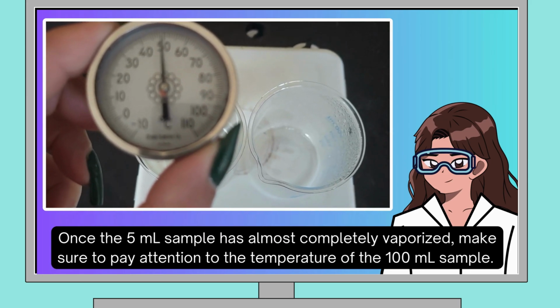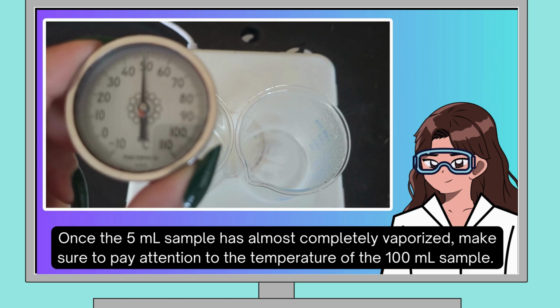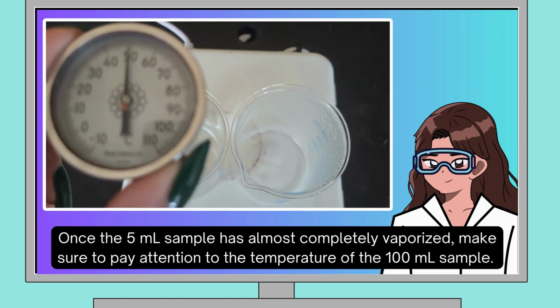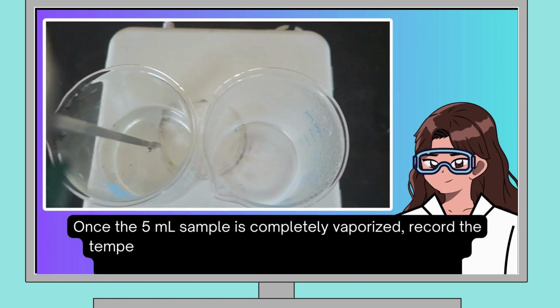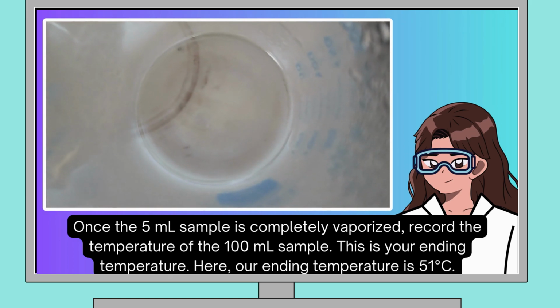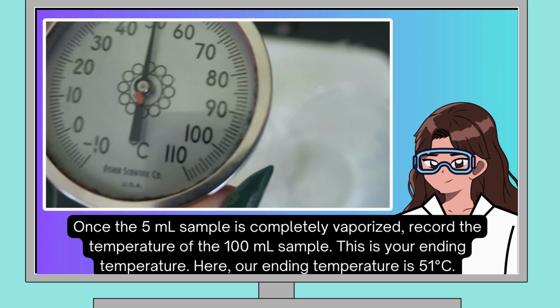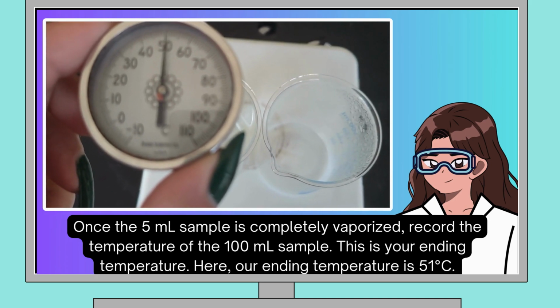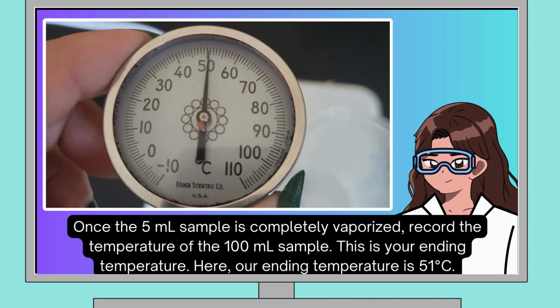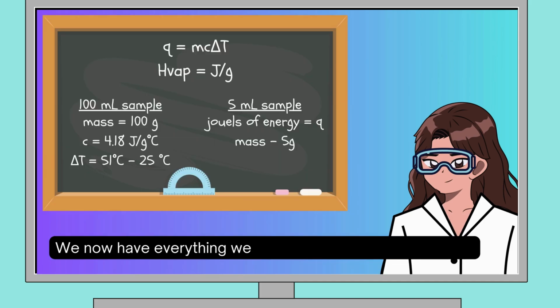Once the 5 milliliter sample has almost completely vaporized, make sure to pay attention to the temperature of the 100 milliliter sample. Once the 5 milliliter sample is completely vaporized, record the temperature of the 100 milliliter sample. This is your ending temperature. Here, our ending temperature is 51 degrees Celsius. We now have everything we need to complete our analysis.